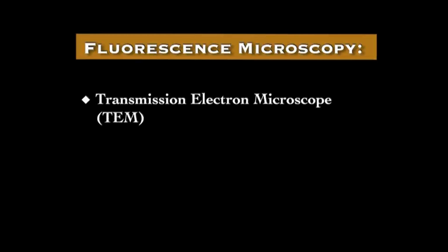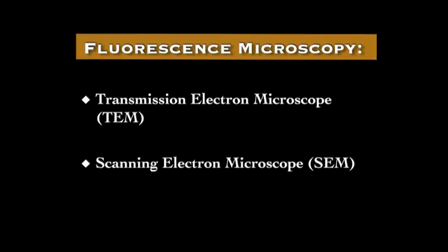Now, I will also talk about the use of electrons in illuminating objects and talk about the details of Transmission Electron Microscope or TEM and Scanning Electron Microscope or SEM. Coming to fluorescence microscopy and the assays, let's also talk about fluorescence.